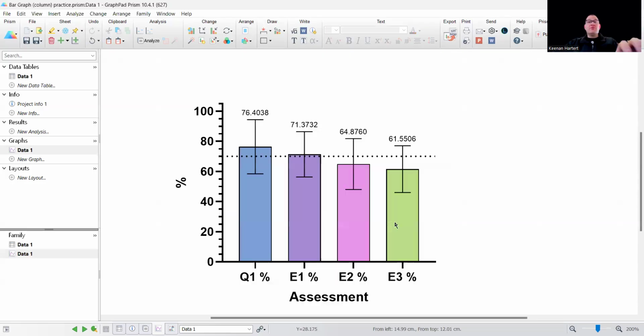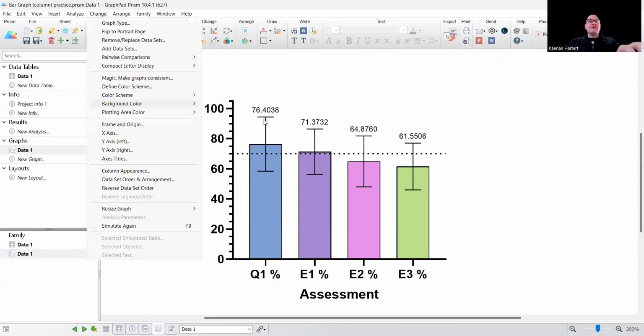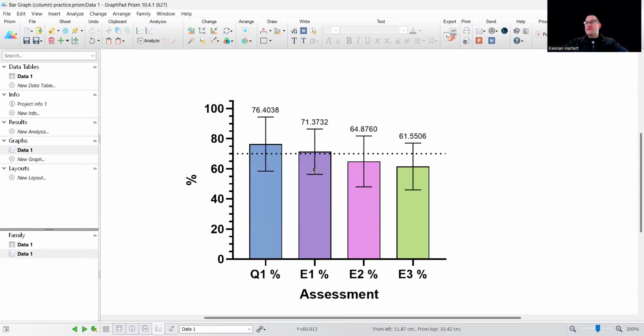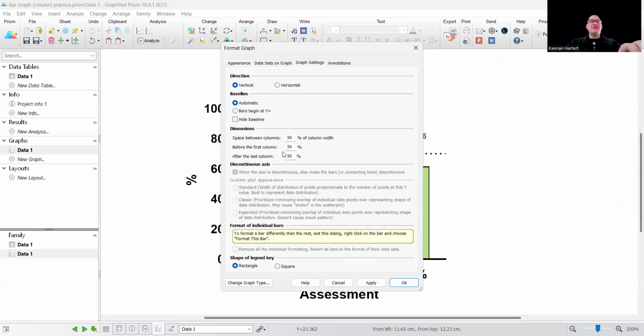Really nice. Really good setup, really easy access. And again, like I said, you can use these color schemes in here perfectly. You can change them, move them, and then you can decide what else to change on your own. Biggest other thing that I really like for bar graphs, by the way, and again, everything that we do is for your personal style that Prism offers, but you really want to get away from default settings of spreadsheet graphs, which are going to be those big, kind of those really spread out blue and orange ones in the grid lines.